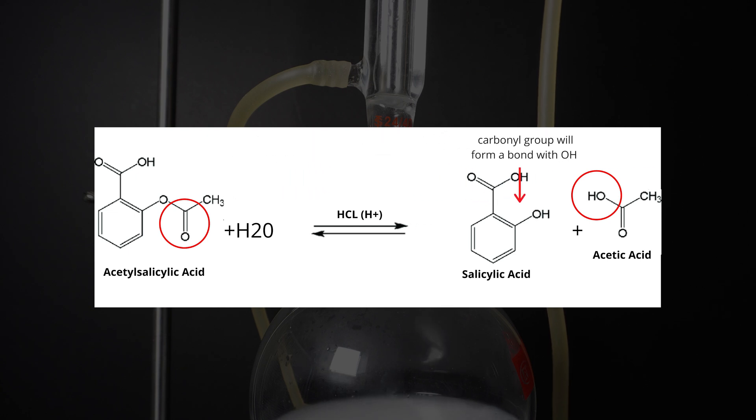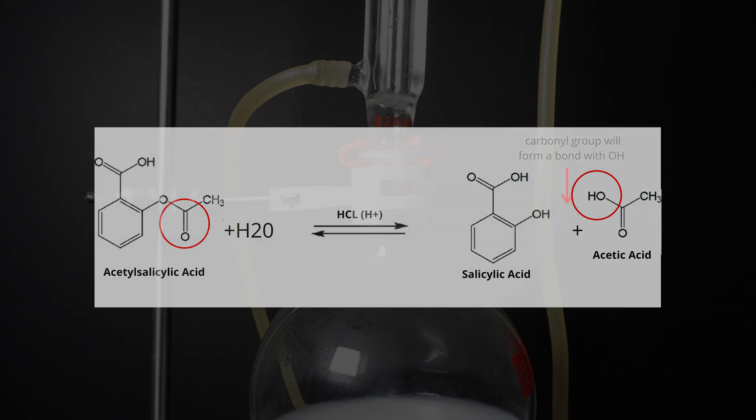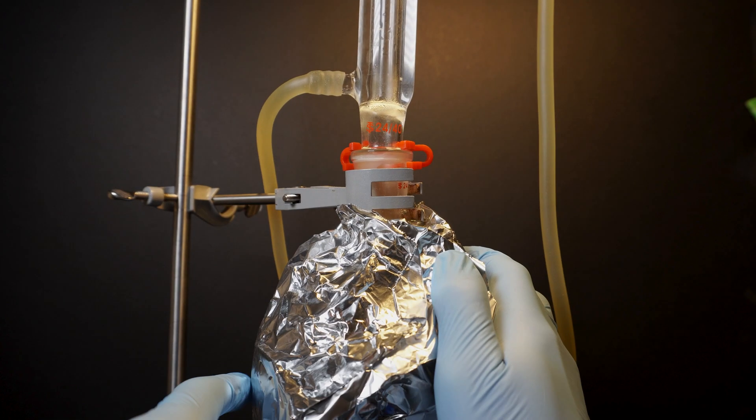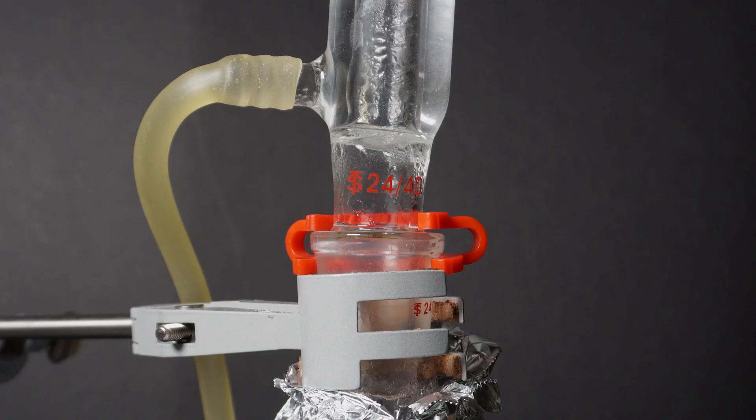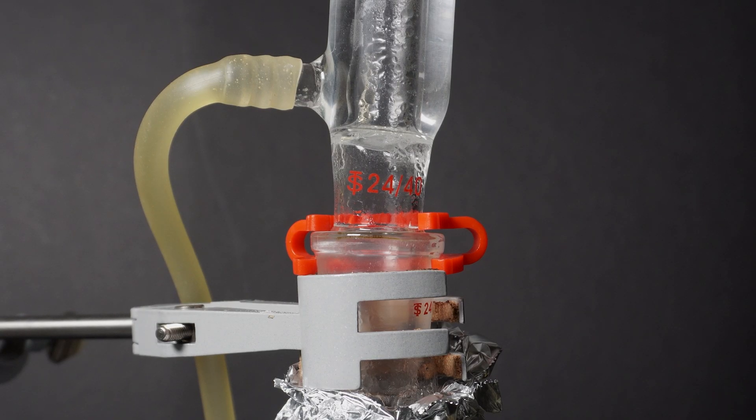To get everything to boil nicely I add some aluminum foil to insulate my round bottom flask. This will speed everything up just a little bit more. Once I see phase change in my condenser I start the 30 minute clock.